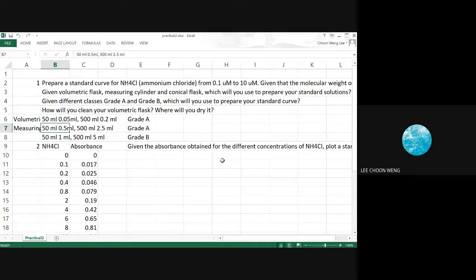Okay, methods suitable for freshwater river lakes may not be suitable for the sea. Okay, because seawater has high salt concentration, and sometimes the high salt concentration affects the determination of nutrients.